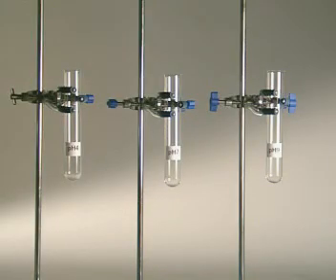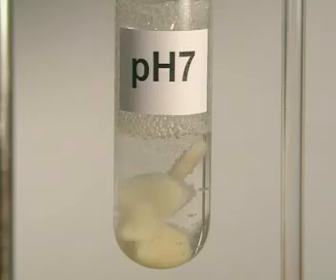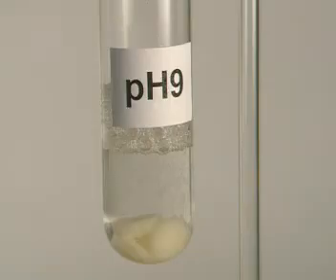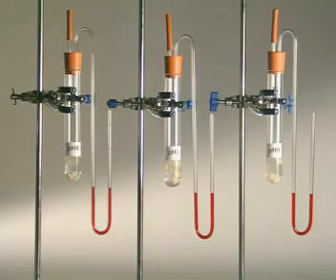The same number of potato discs are placed in test tubes containing hydrogen peroxide solutions at pH 4, 7, and 9. A simple manometer is attached to each tube.